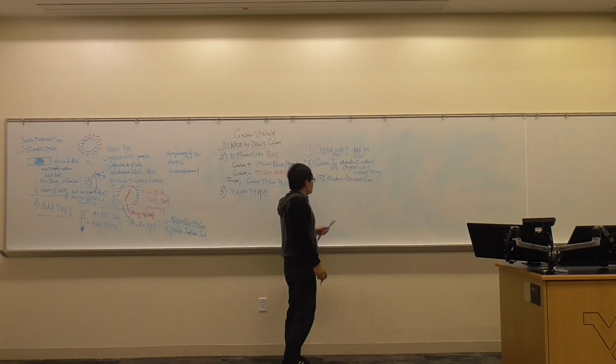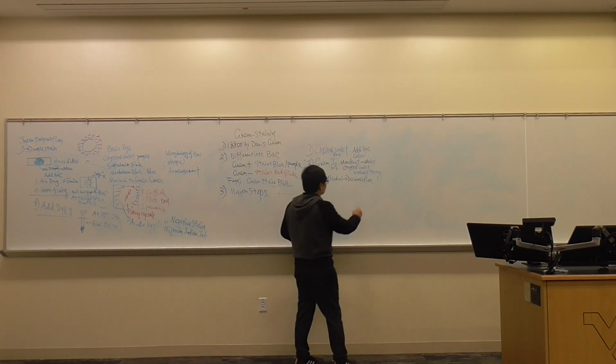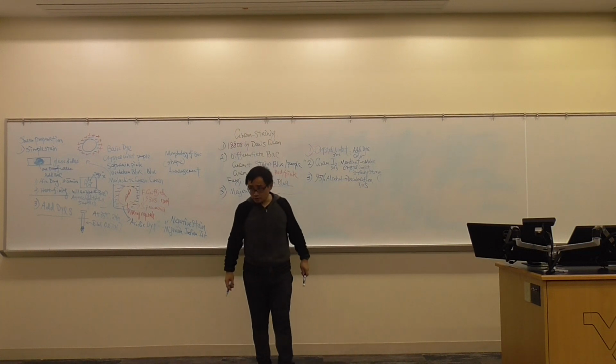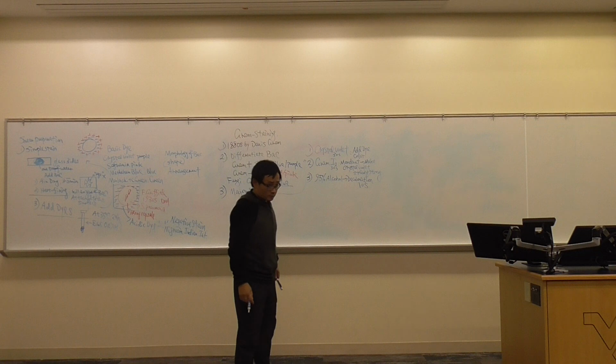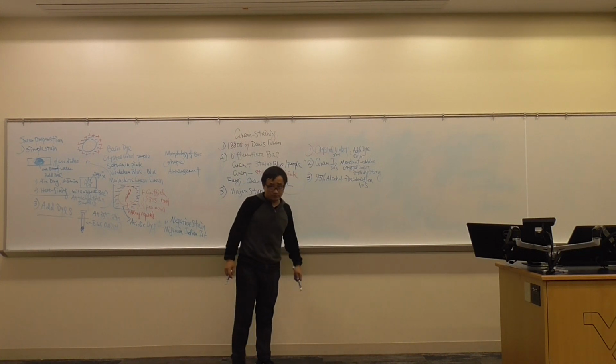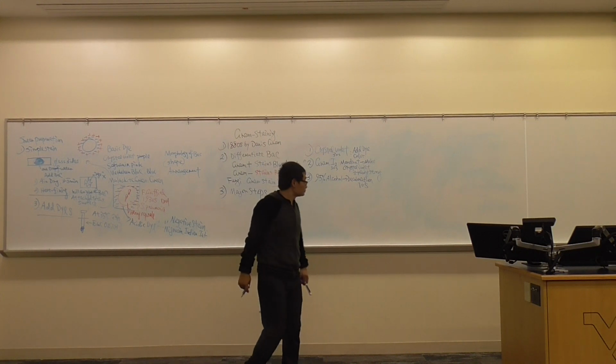Decolorization, because alcohol could be removing the dye or washing off the dye, so we do very short, only 10 seconds. How do you count 10 seconds? Just count 10 Mississippi. 30 seconds, how do you do it? Some people say sing a happy birthday song, but we usually don't do that. We just time 30 seconds.